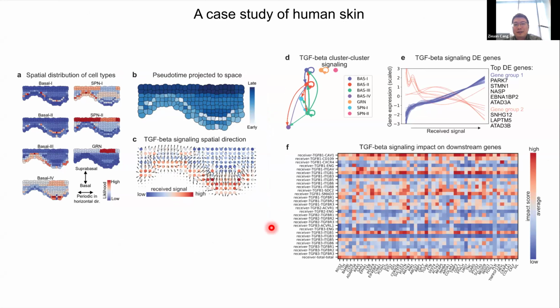One is the cell-cell communication we inferred, and the other is other highly variable genes or other genes that are correlated with the genes of interest. Then we look at how much prediction benefit we get by adding the cell-cell communication as additional features. Intuitively, if the improvement is large, that means the cell-cell communication we inferred is providing a lot of unique information about the genes of interest.